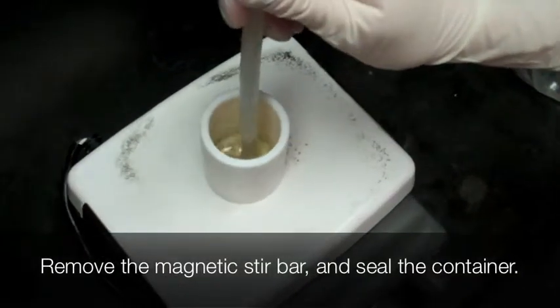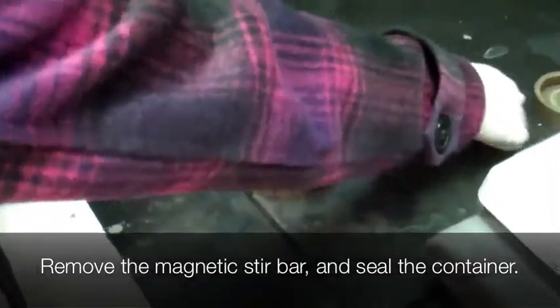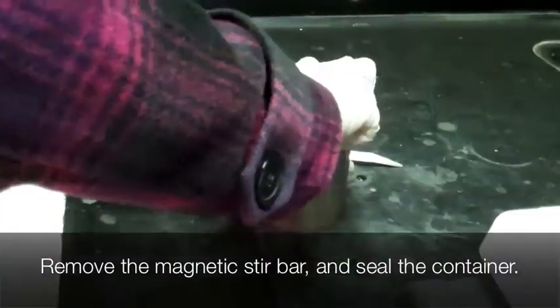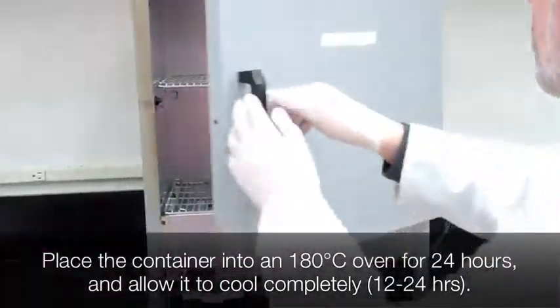Remove the magnetic stir bar from the solution. Place a Teflon sleeve into the 60 milliliter Teflon-lined autoclave pressure vessel. Seal the container and anneal at 180 degrees Celsius for 24 hours. Then allow it to cool completely for 12 to 24 hours.